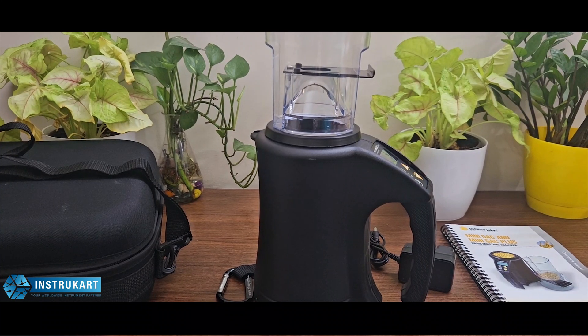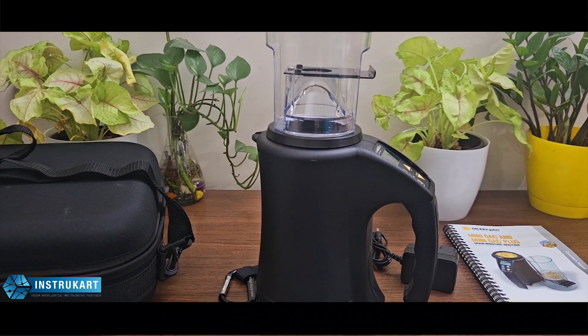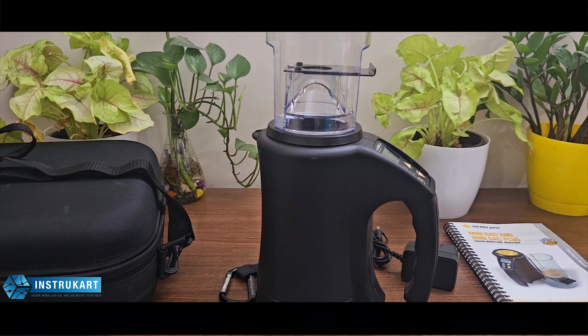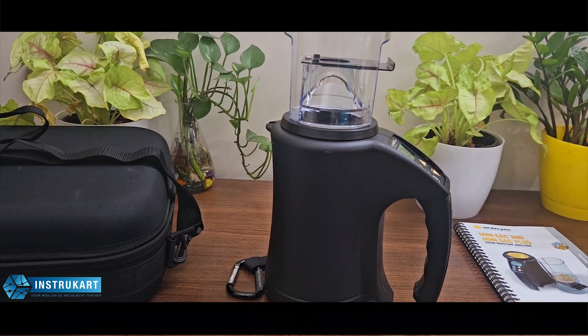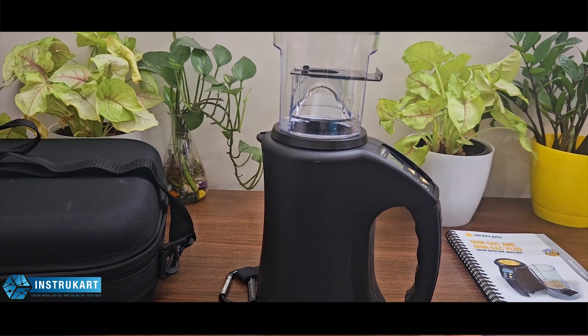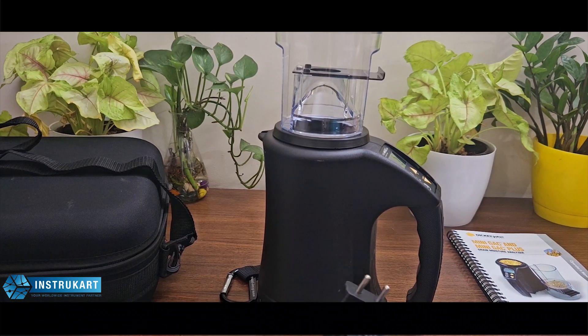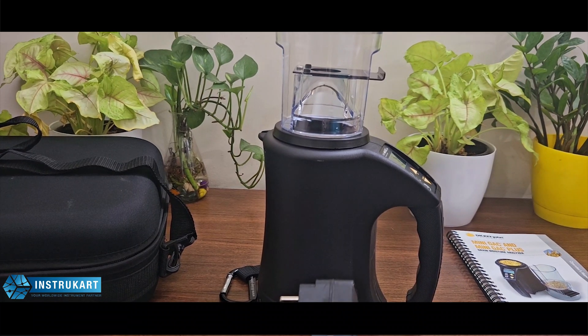The grain temperature range is 0 to 50 degrees Celsius, and the temperature difference between instrument and grain sample can be 20 degrees Celsius. The operating temperature for this moisture meter is 5 to 45 degrees Celsius. Power supply takes a 9-volt battery or a charger, and the humidity range is 5 to 95 percent.